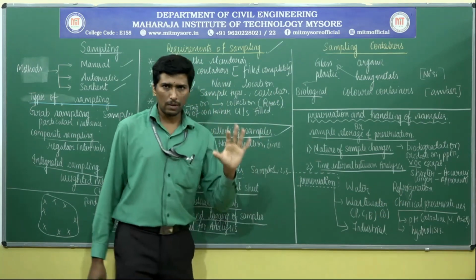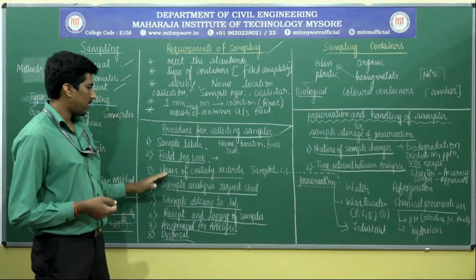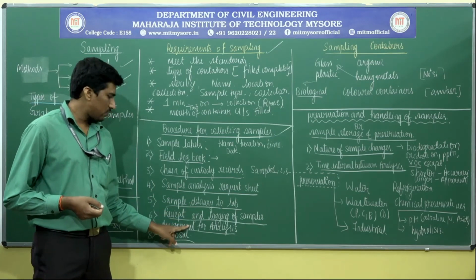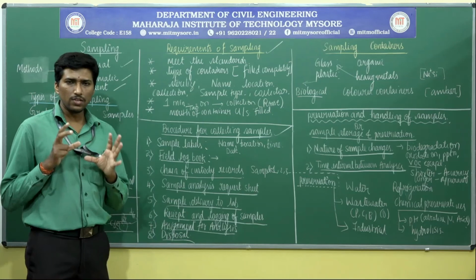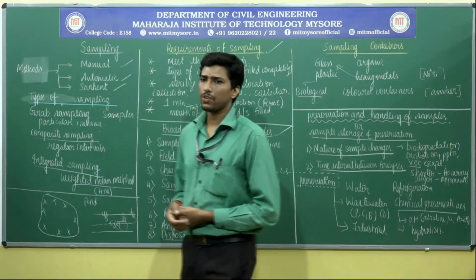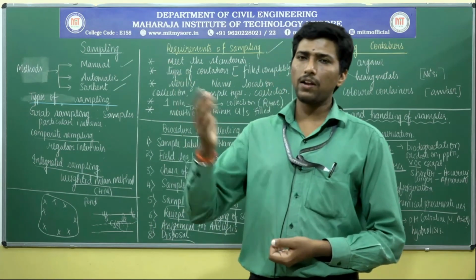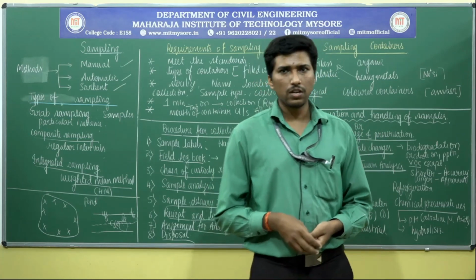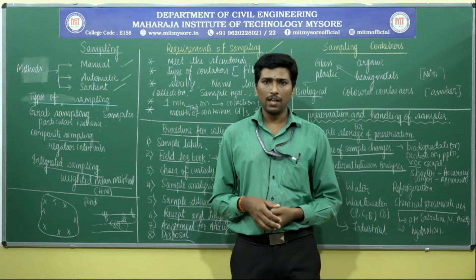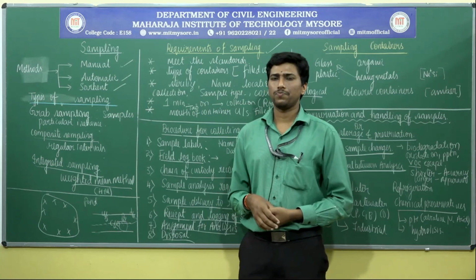What are the stages that you come across? First is sample collection, then sample delivery to the lab, sample analysis, and then disposal. These are the practices that we come across in the laboratory, okay. Whether it is a water treatment plant or a wastewater treatment plant, the laboratory setups are made there, and they go for analysis on a daily basis.